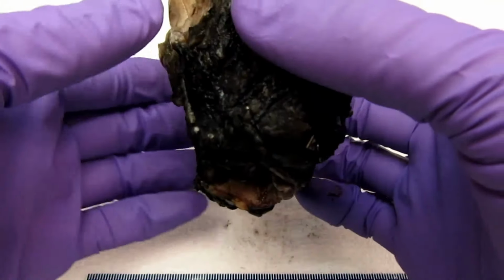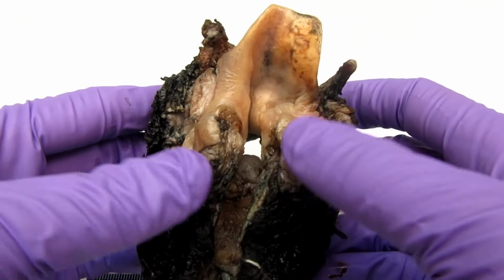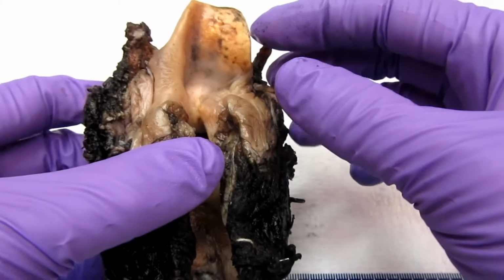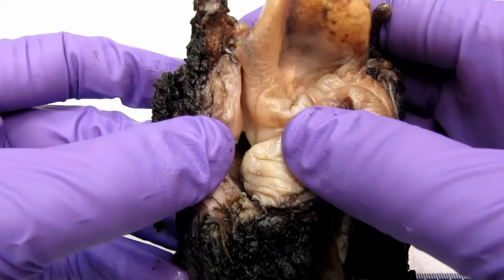Now we're flipping our specimen over to the posterior aspect, where we can get a better look at our laryngeal mucosa, our aryepiglottic folds, and our piriform sinus, which also appears to have a defect in it.